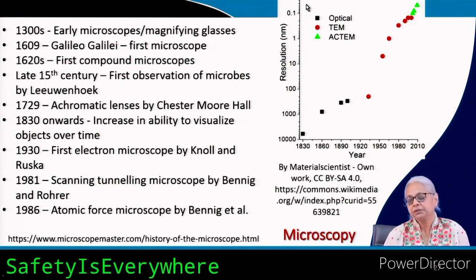And over here in the top right corner, what you see is resolution over time. By now you're all clear about the fact that improving the resolution of microscopes is the main objective in microscopy, and we have now reached a level that is far below 1 angstrom.